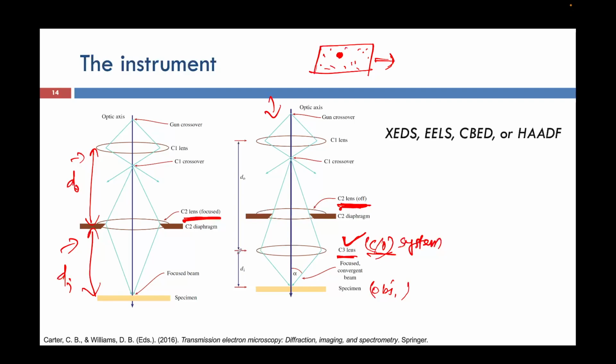If I am talking about D0, the object distance, that means U, which is a familiar term to you, and my Di is nothing but V, that means image distance. If you remember, we have told that in an electron microscope the demagnification will always be high. So in this case, U by V is considered as the demagnification.